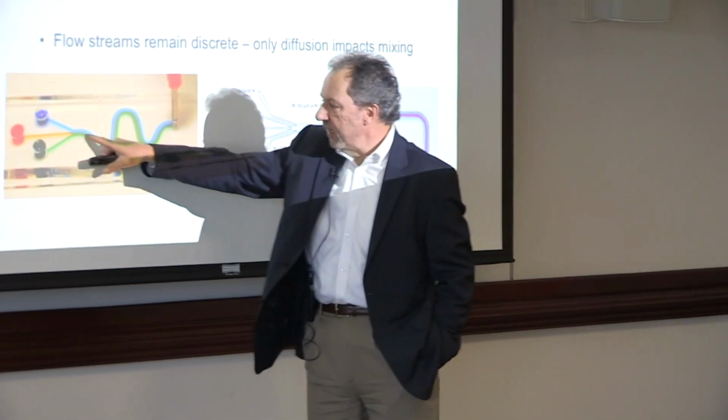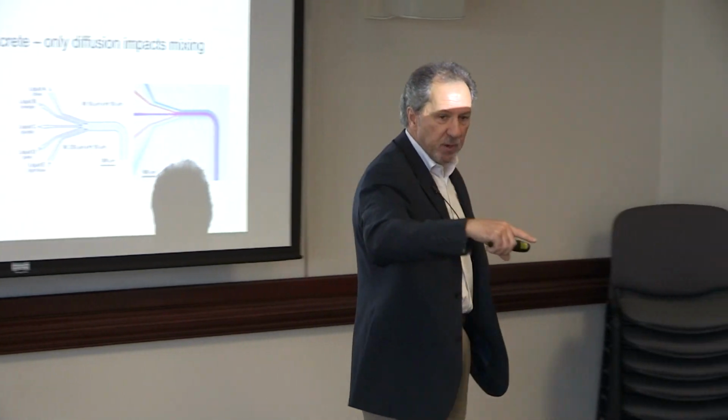So it's in that transition that we start to see that, in fact, the same kind of fluid with the same viscosity in 2 pipes of a different size actually transition from turbulent to non-turbulent flow. And that's an important thing for microfluidics, because what it says is that we can now take 3 different solutions, have them come in from a trifurcated structure into a single channel, and they will remain essentially non-mixed in a laminar flow as it progresses down that channel.